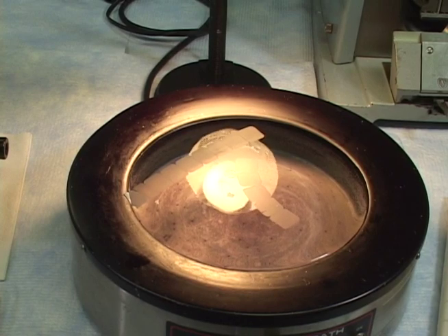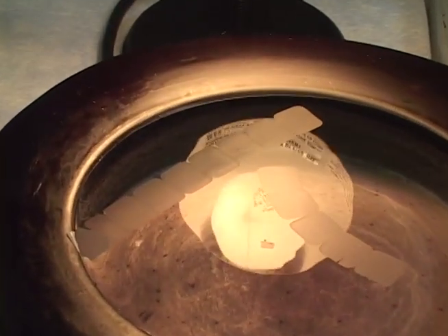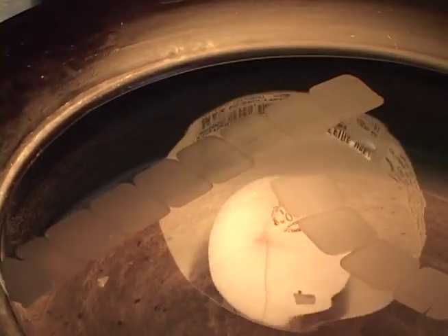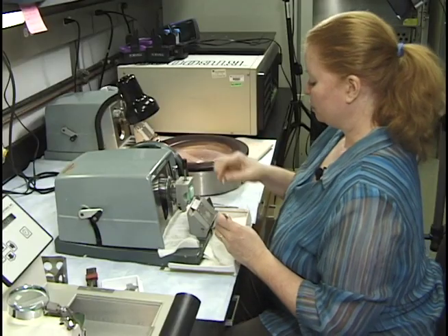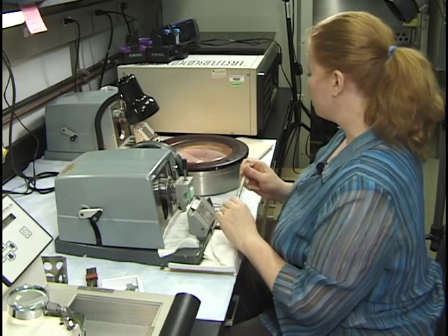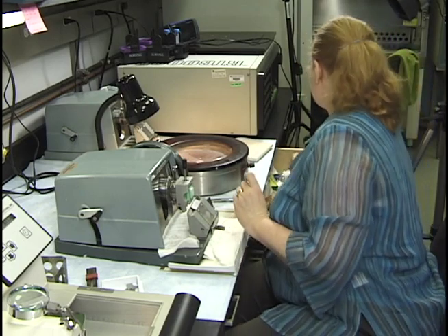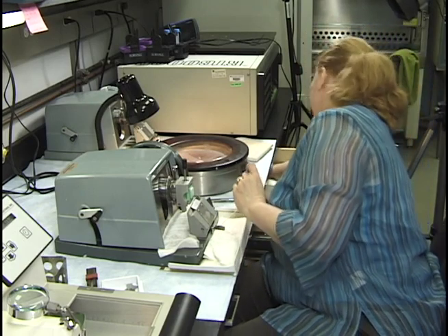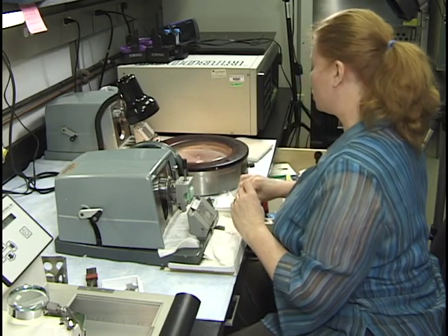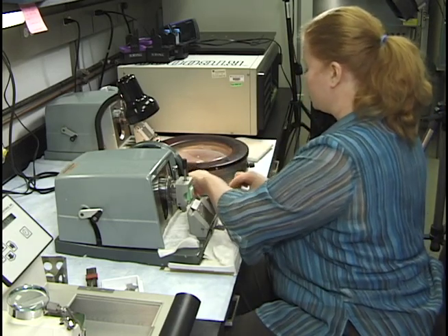So maybe this knife wasn't clamping on one side a little bit more than the other. It needed that full. So just moving that a little bit helped it. Okay. Now you can practice with a blank ribbon like that without precious tissue. You can practice picking up. I'm going to use some inexpensive non-charge slides for picking up, which is not what we typically use.